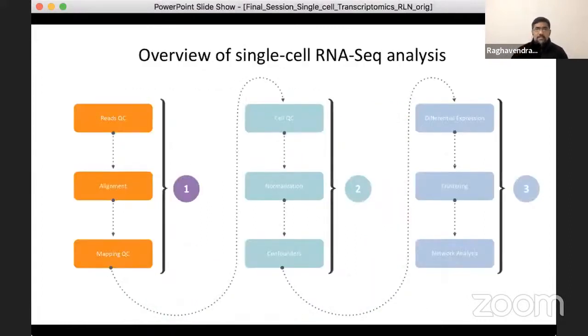Single-cell RNA-seq analysis includes several steps of quality control and normalization. Due to the small amount of material per cell and the sensitivity of the sequencing, it is best to identify unreliable data sets and exclude them from the downstream analysis, and just use the rest of the data, which can be normalized, and has to be normalized, to be able to compare and perform downstream analysis.